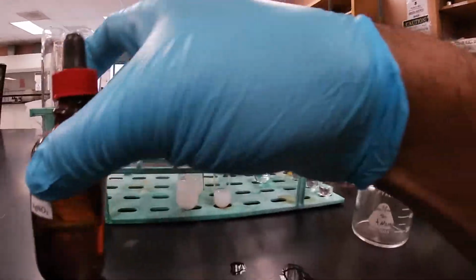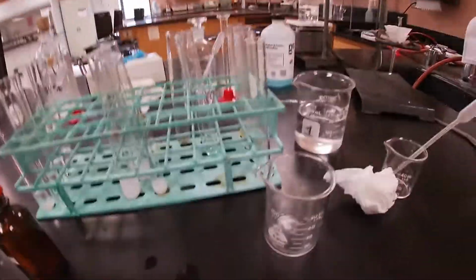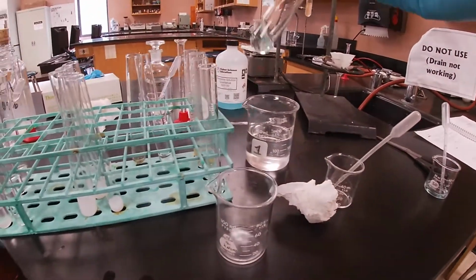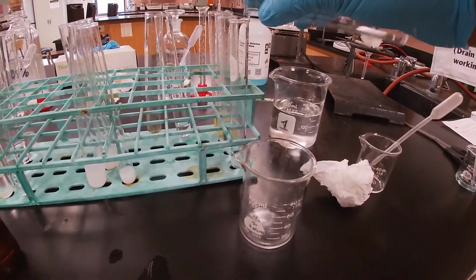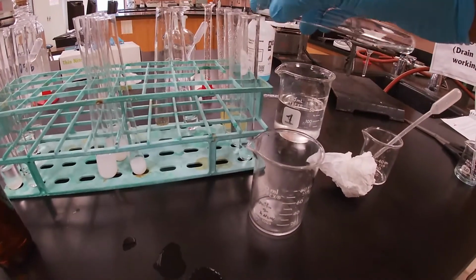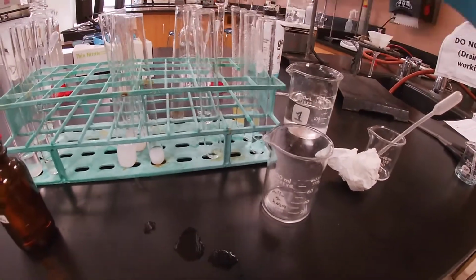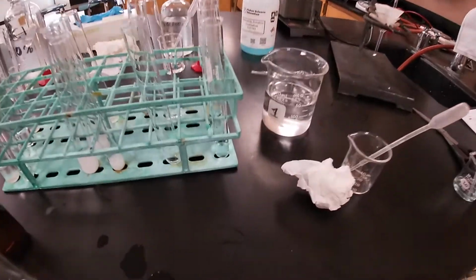And then our final addition. So I had already measured out my contents of my Benedict solution. So we'll go ahead and add it to our test tube. We'll add a little bit more. And then we'll start heating it up in our bath to see if there's any sugar present.